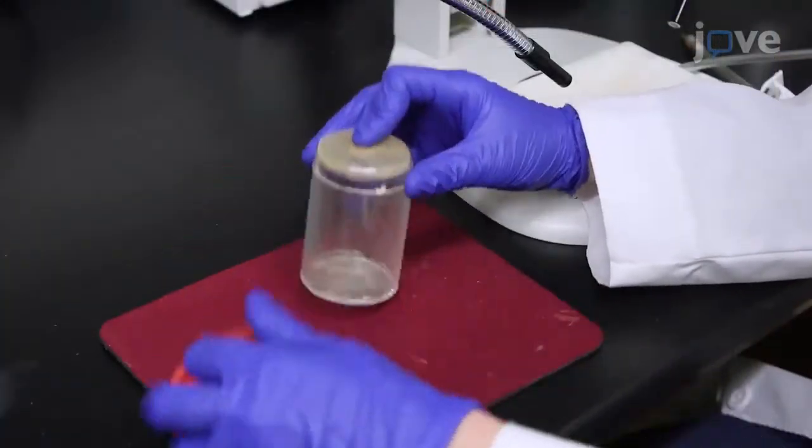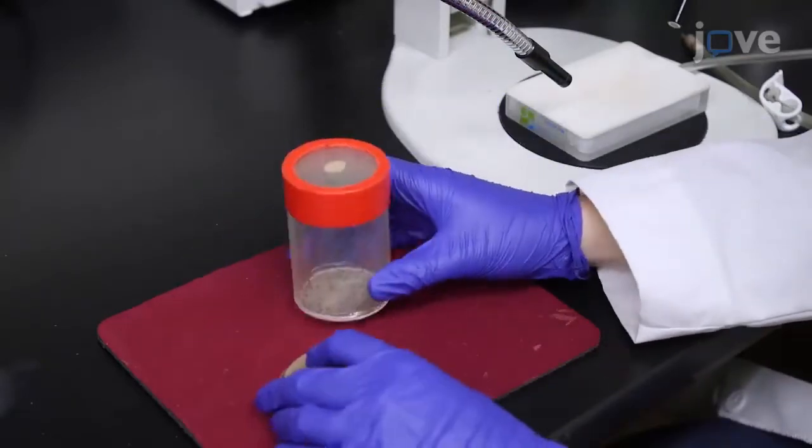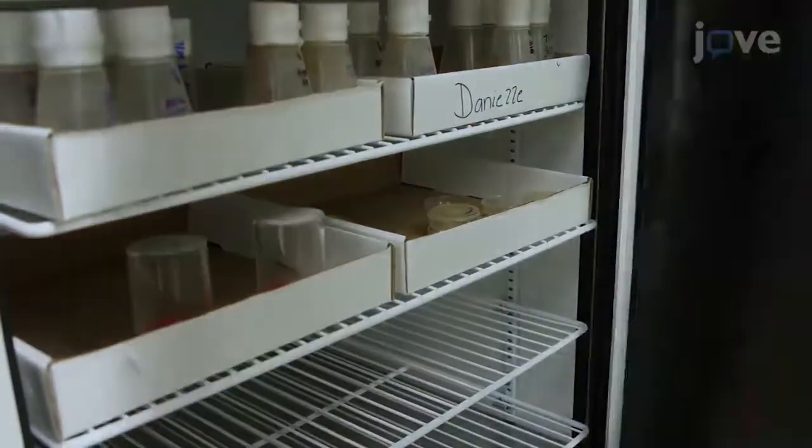To collect late stage 17 embryos for injection, replace the apple juice agar plate with a new pre-warmed plate with a smear of yeast paste and allow the flies to lay eggs on the plate at 25 degrees Celsius.